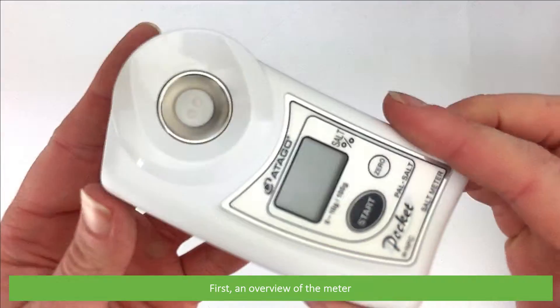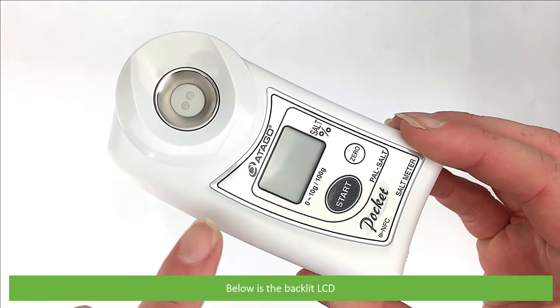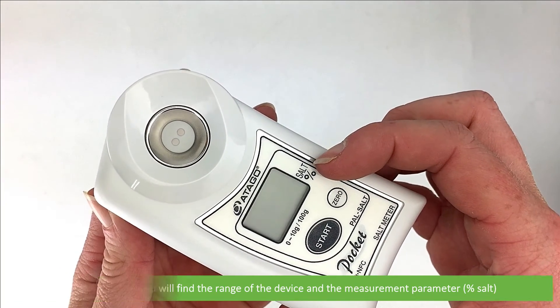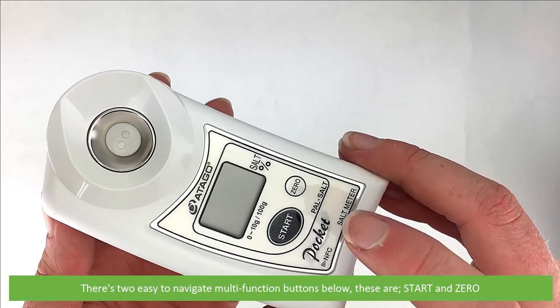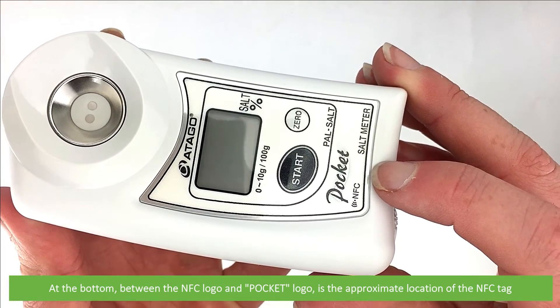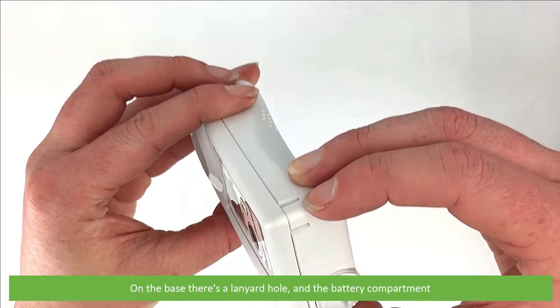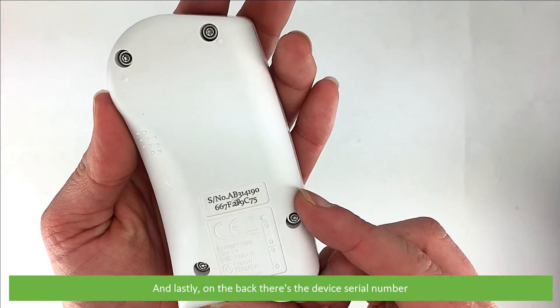Here's an overview of the meter. On the top of the meter there's the sample stage and the salt sensor. Below is the backlit LCD. Around the LCD you will find the range of the device and the measurement parameter — that's percentage salt. There are two easy-to-navigate multifunction buttons below: start and zero. At the bottom, between the NFC logo and the pocket logo, is the approximate location of the NFC tag. On the base there's a lanyard hole and the battery compartment, and on the back there's the device serial number.